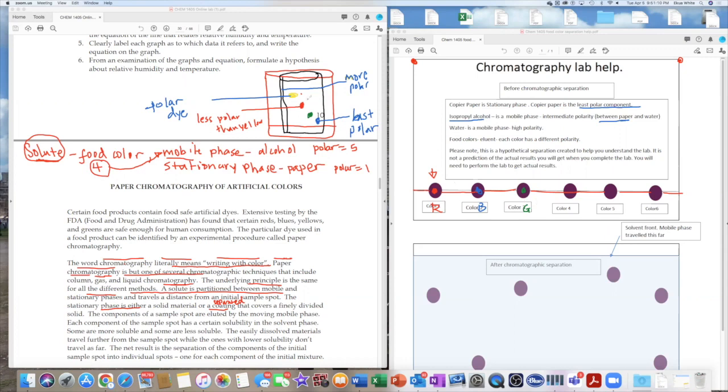Okay, so once we figure out that the moving solvent will not only pull out the dyes, if you had a mixture, if you had a dye that was made of a mixture, let's say, for example, this is blue, and instead of having blue here, say we had pink. Oh no. Let's go with orange. Say we had orange, okay?